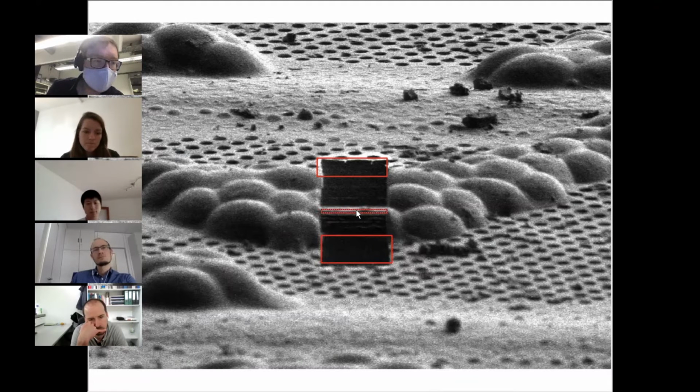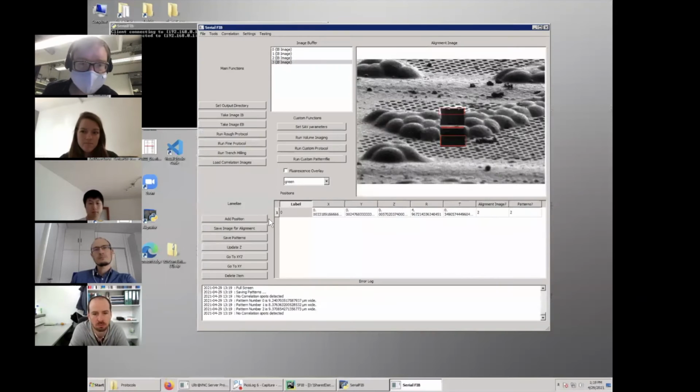Herman looked into that a lot and had some nice plots on ways to visualize that, which you could show later as well. So we go with something like this, and then you would do that for each position to make the success rate a little higher.